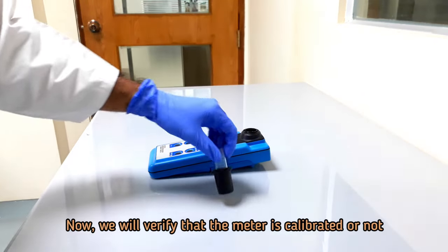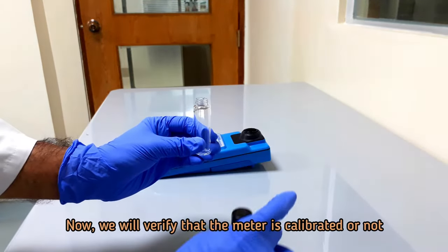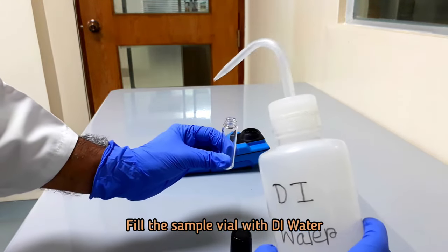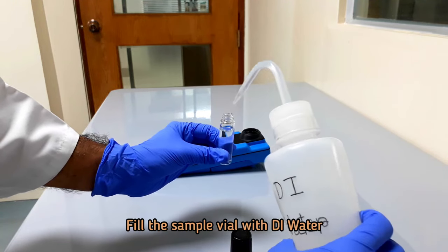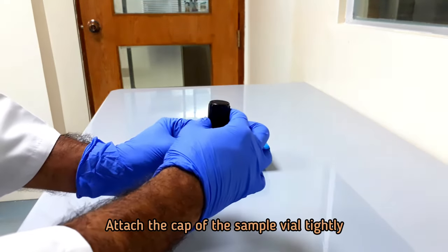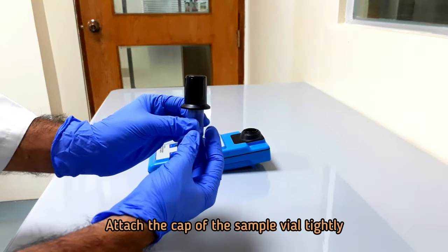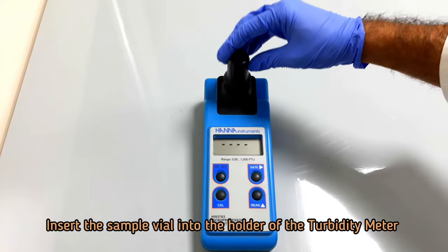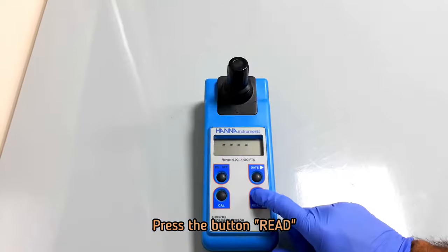Now we will verify that the meter is calibrated or not. Fill the sample vial with deionized water. Attach the cap of the sample vial tightly. Insert the sample vial into the holder of the turbidity meter. Press the button read.